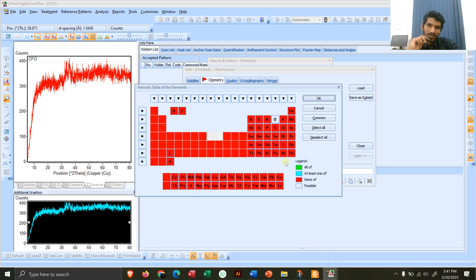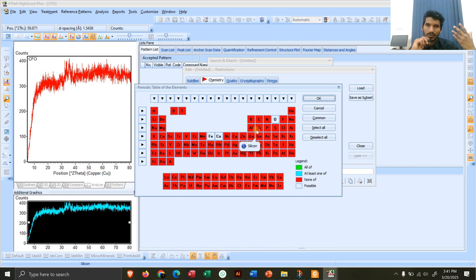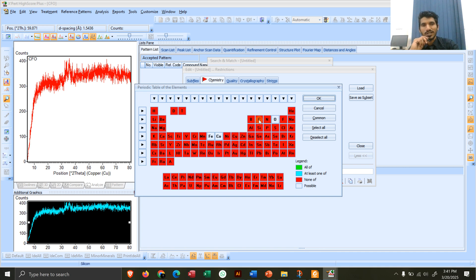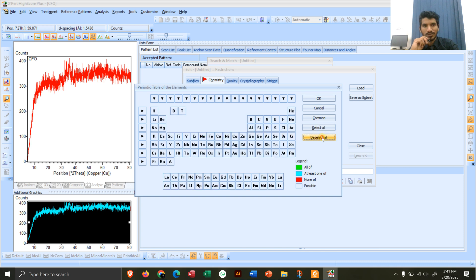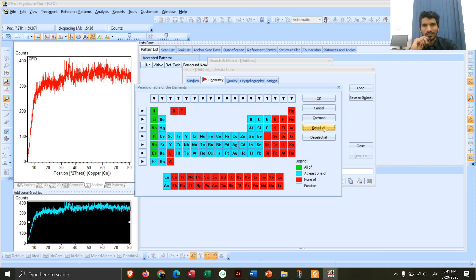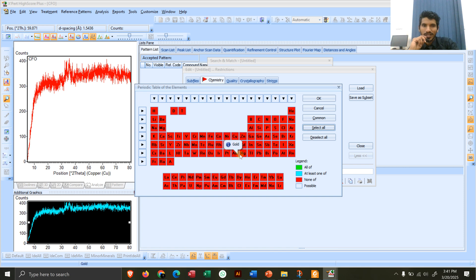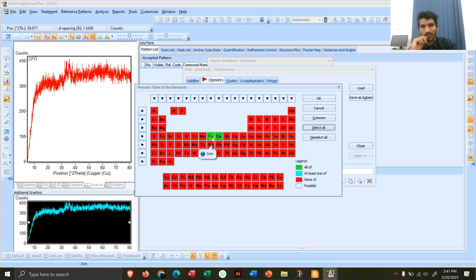Go to the Priority Table. There are options: red means none of those elements should be searched — they are not present in the compound. Select all and toggle until all are turned red (none present). Now, since I know my compound contains cobalt, I will color cobalt green (definitely present). I am also definitely sure that iron must be present, so I color iron green. And oxygen should also be present, so I color oxygen green as well.